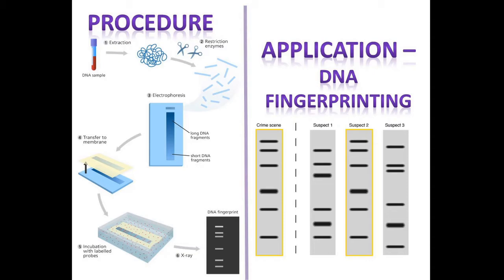After isolation, the DNA is treated with a restriction endonuclease, and the resulting fragments are separated by agarose gel electrophoresis embedded with ethidium bromide stain and then visualized under UV. A Southern blotting is then carried out, where the fragments on the gel following denaturation are transferred to a nitrocellulose or nylon matrix. The blotted DNA is then hybridized with specific radiolabeled probes or fluorescent labeled probes.